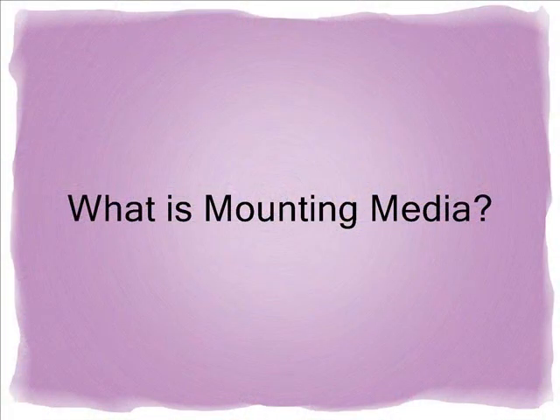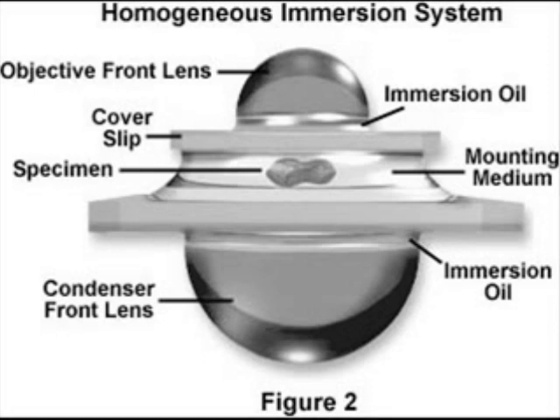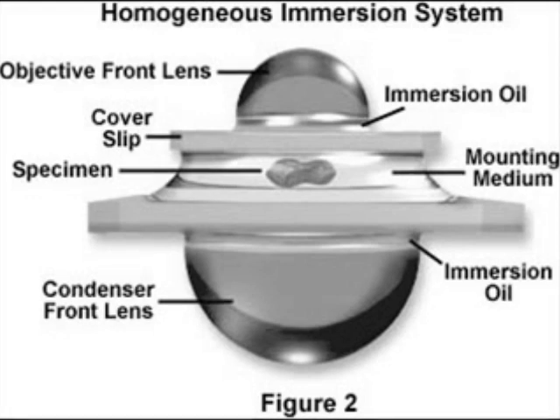To begin, what is mounting media? The mounting media holds specimens in place between a cover slip and a glass slide. The analyst's choice of the right mounting media is a separate topic all on its own. However, before understanding the purpose of mounting medium, one must understand refraction and reflection of light in a microscope, refractive index, and relief.